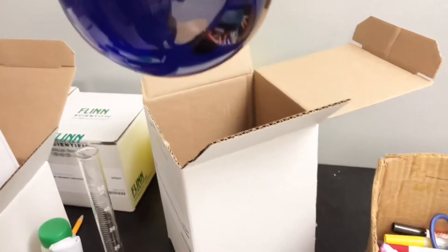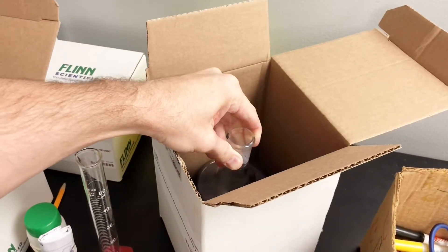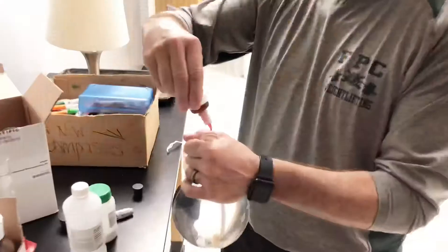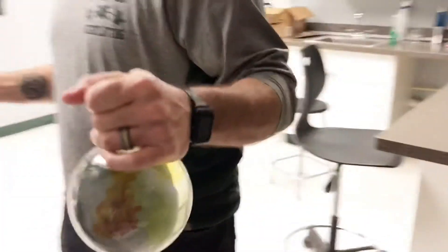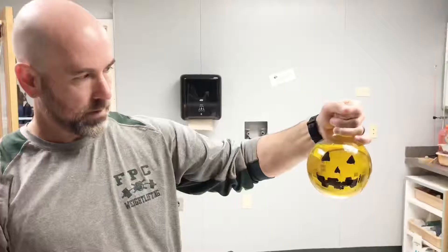Okay, so we have sodium hydroxide, glucose, and methylene blue indicator. Let it sit undisturbed until it turns clear — stop disturbing it. Then add 10 to 20 drops of food coloring. Wow, this is like one minute later — you just put food coloring in there.